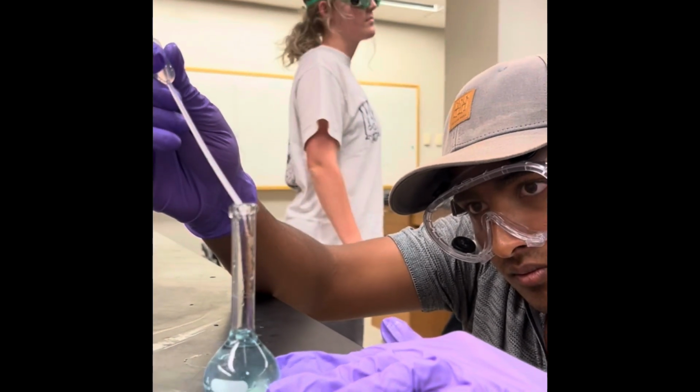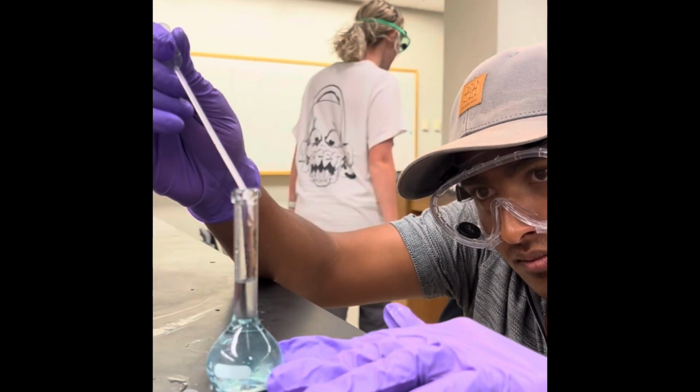The meniscus of the volumetric flask can be seen sitting directly on the mark.